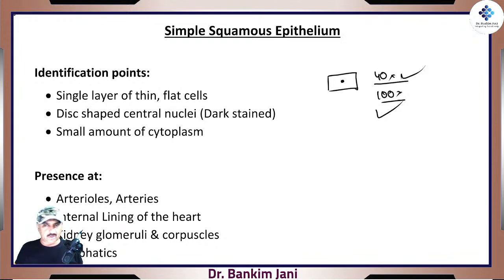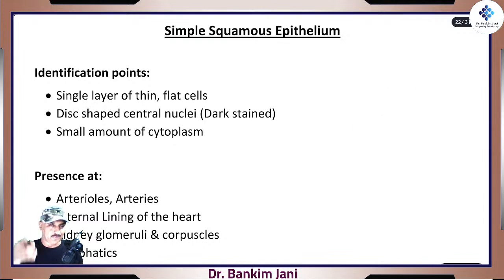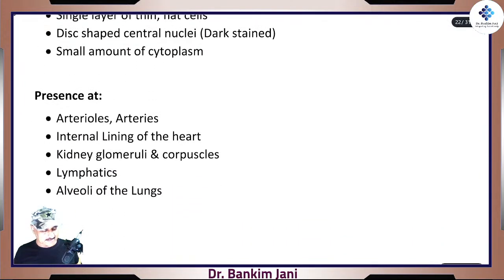Once we see all these images, I'll show you the same slides, these only, and you will enjoy. Sometimes you'll find it is exactly the same area. Sometimes it takes a few seconds or few minutes to figure out where exactly that area is. Plus the focus keeps on moving, because as you change the magnification, you have to go for the finer focus. But fine, we'll do all those things. This is just the revision.